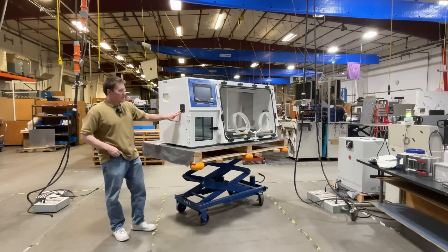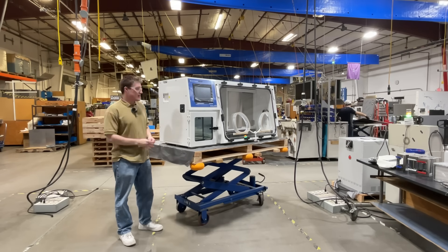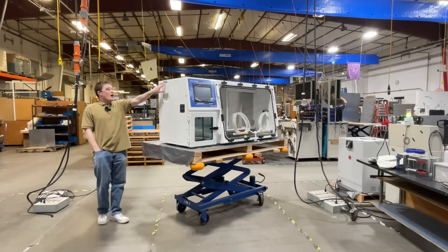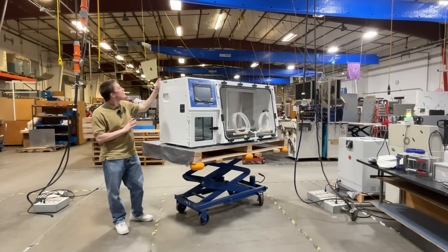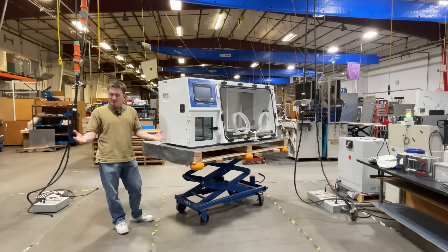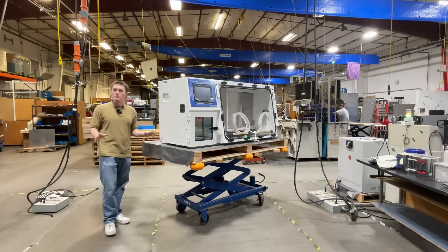Over here is our OTL dial. This is a safety feature that cuts off temperature to the elements should an overheating event occur. Higher up are the AMG and N2 inlet. The unit is capable of operating using both AMG and nitrogen, which will save money, or solely AMG. The unit is ready out of the box to accommodate both scenarios.